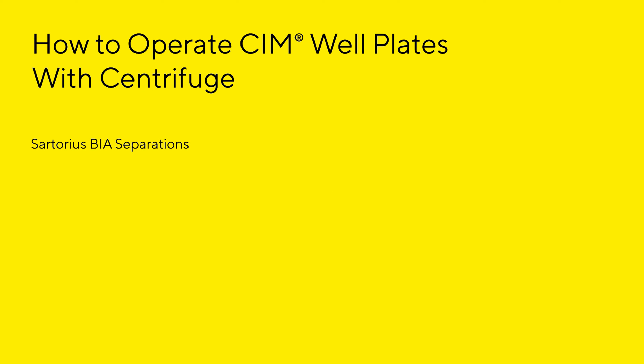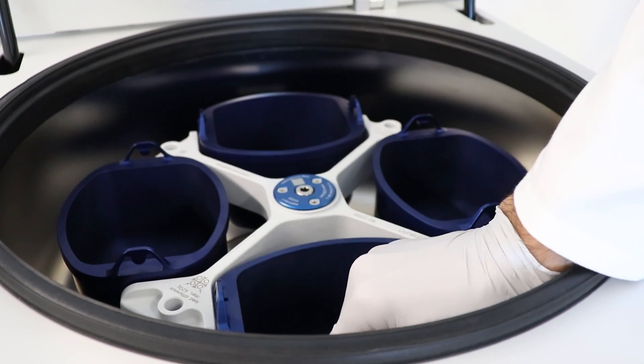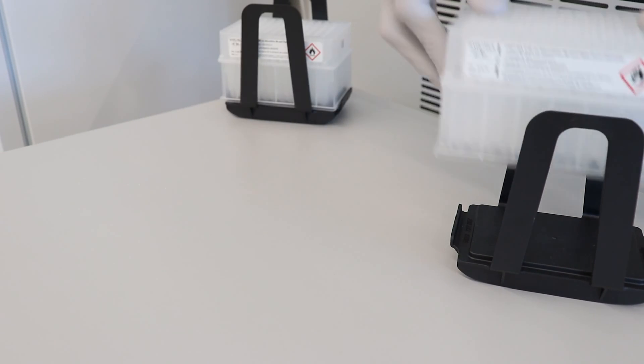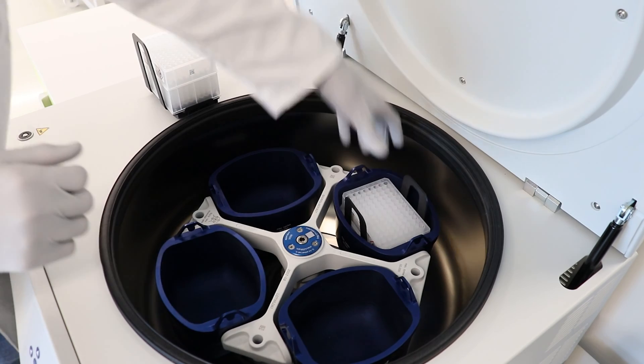When operating the plates with a centrifuge, make sure your rotor and bucket are compatible with deep well plates. Start by positioning the monolithic plate above the collection plate and carefully place both in the rotor's plate carrier. Put the assembled package into the rotor's bucket.